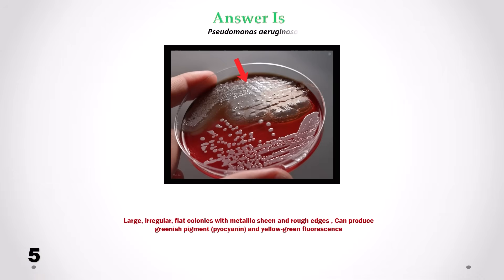Can you identify this bacteria? Correct answer is Pseudomonas aeruginosa. We can see large irregular flat colonies with metallic sheen and rough edges. Pseudomonas bacteria can produce greenish pigment pyocyanin and yellow-green fluorescence.